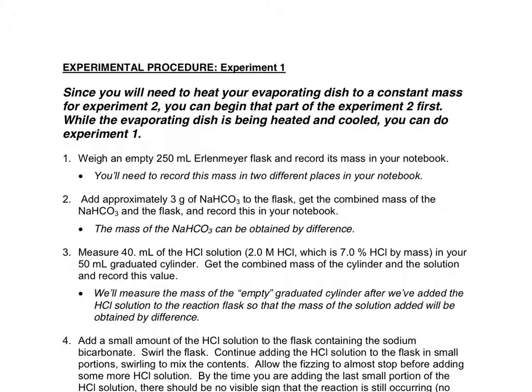Then it says that you're going to use your 50 ml graduated cylinder. Underneath that first hood is that acid you're going to be using, that 2 molar HCl. There is a dedicated transfer beaker in front of that jug of 2 molar HCl back there. It says get 40 milliliters with 2 significant figures, but if you read what you're going to do, you're going to get a mass of your HCl solution.